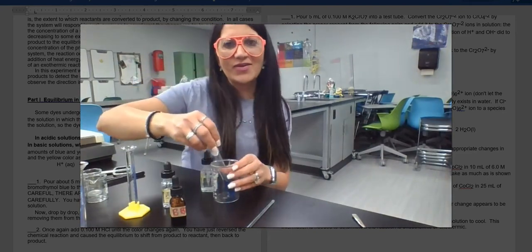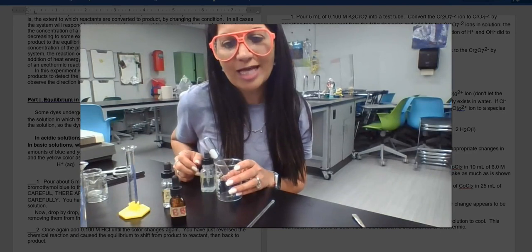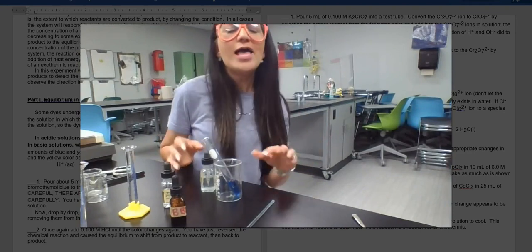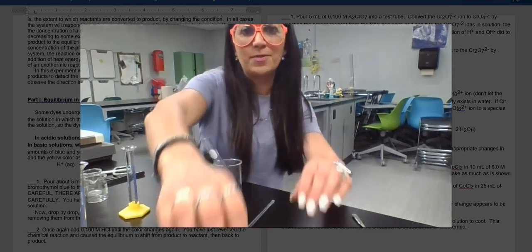Okay. All right. So it says you've just reversed the chemical reaction and caused the equilibrium to shift from product to reactant, then back to product, kind of giving you a little bit more information than you even need to know. I want you to pause now and go ahead and answer your questions for part 1, and we'll be back for part 2.